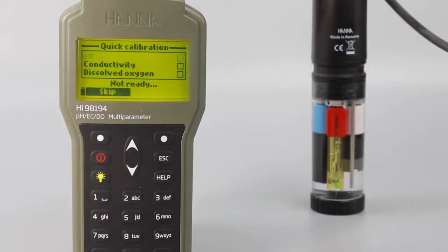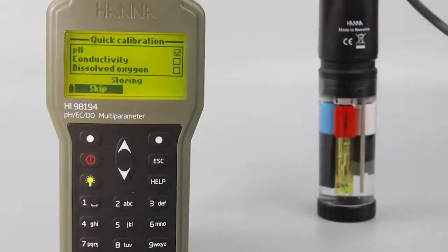You'll calibrate for each sensor in stages. If you want to skip calibration on a specific sensor, just press skip.